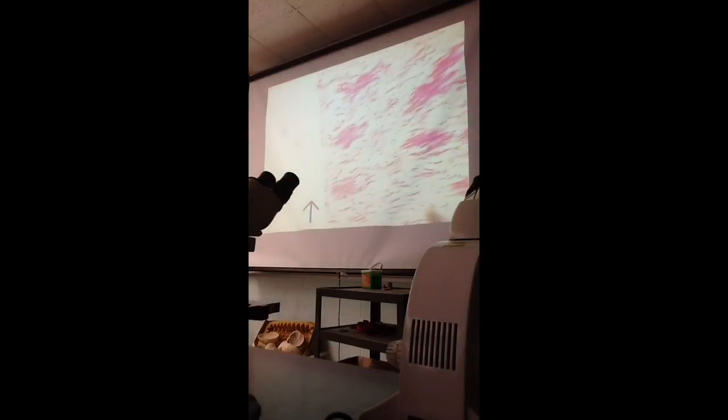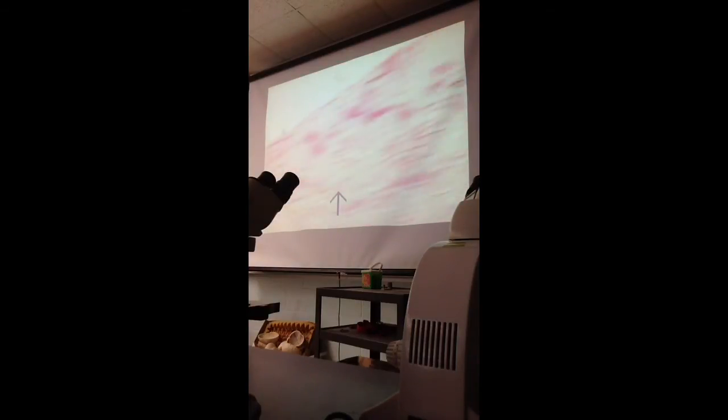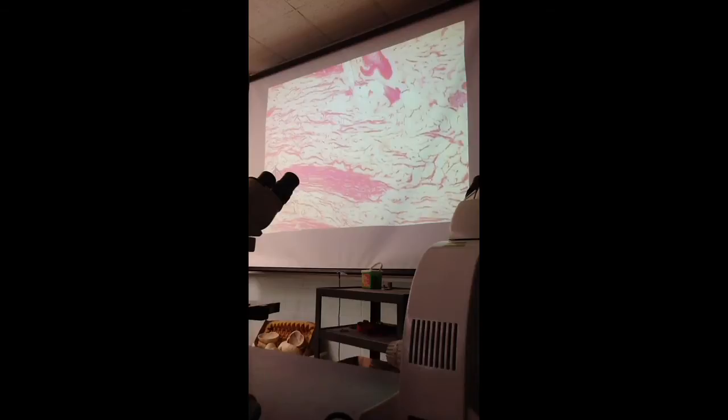And you see these straight tubules? Vasa recta. These straight tubules are the vasa recta, or the peritubular capillaries.